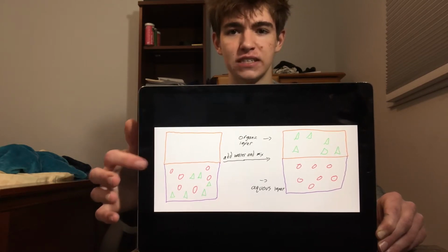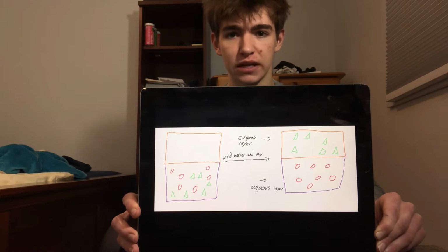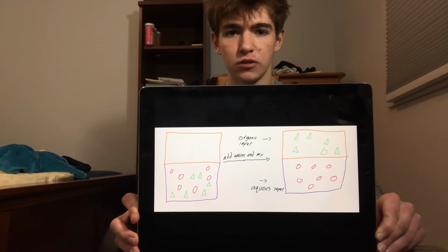As I have detailed in my model. So the ionized water-soluble piperidine will be pulled into the water, which is then creating the aqueous layer. The water-insoluble benzene and anthracene will remain in the organic neutral layer because they are water-insoluble.